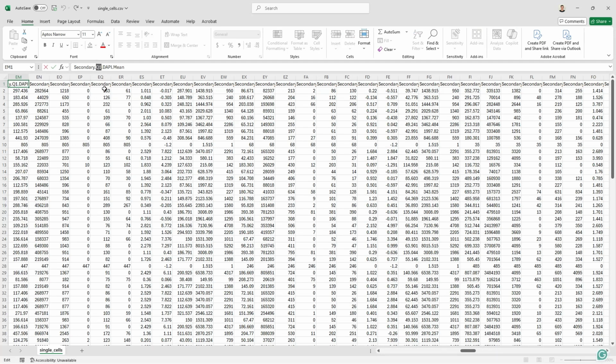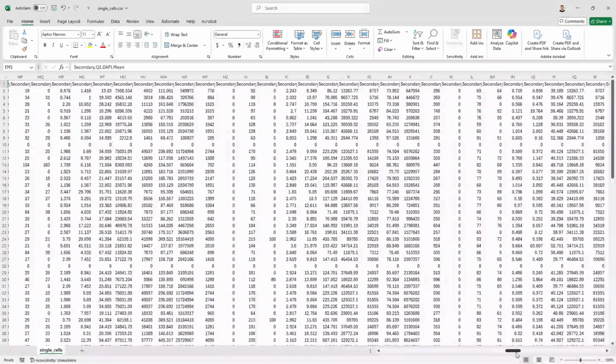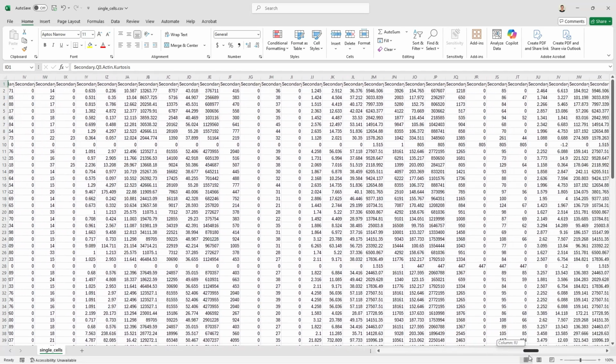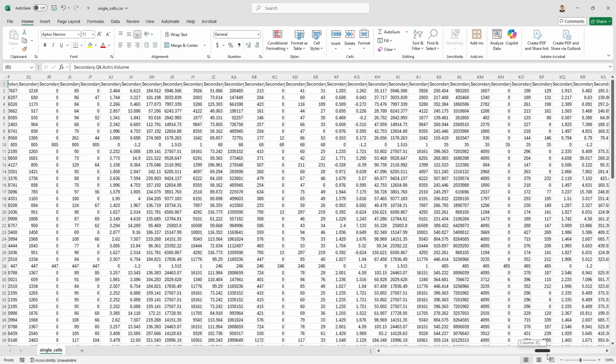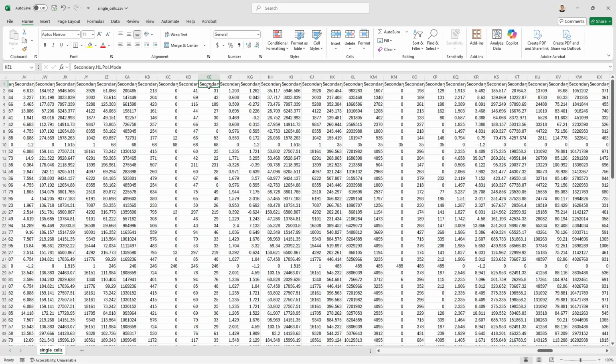So we have Q1, which is the quarter of the cell, so the innermost portion of this cell. This is the mean DAPI intensity. All of that intensity data again is stored at a single cell level, and it's all row matched. So as we work our way across, we then run into Q3 eventually, and then Q4, the outermost component to those cellular rings that we've created, and now we're at H1, which is the halves.